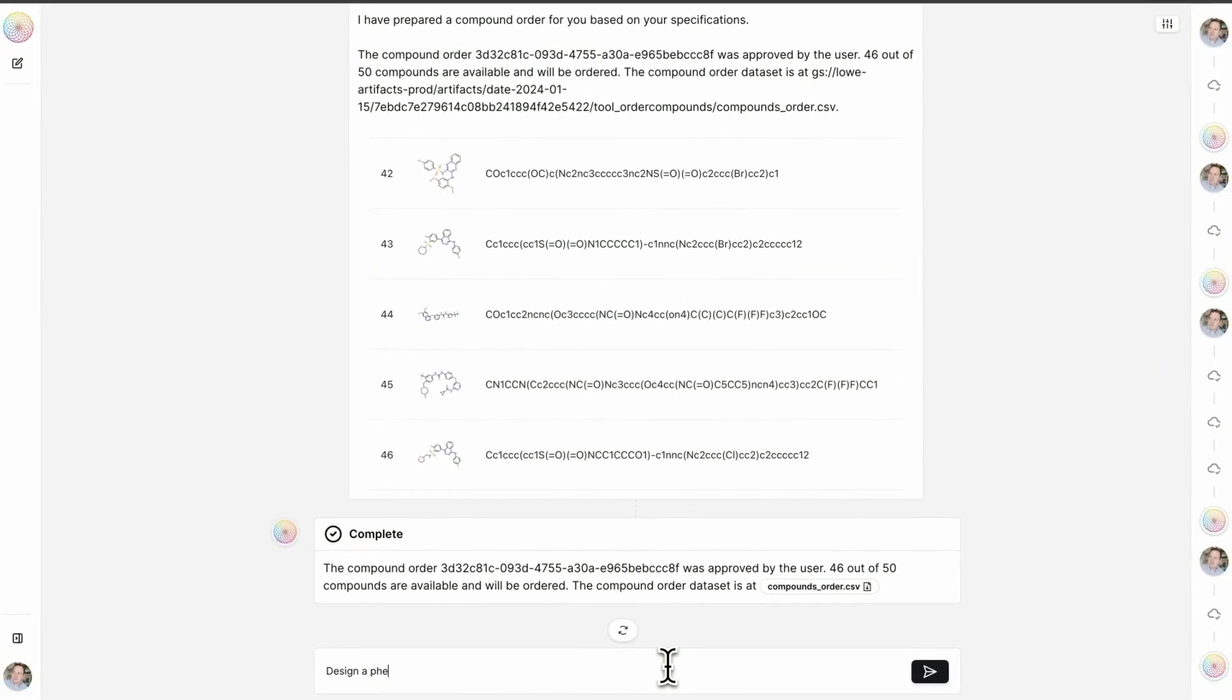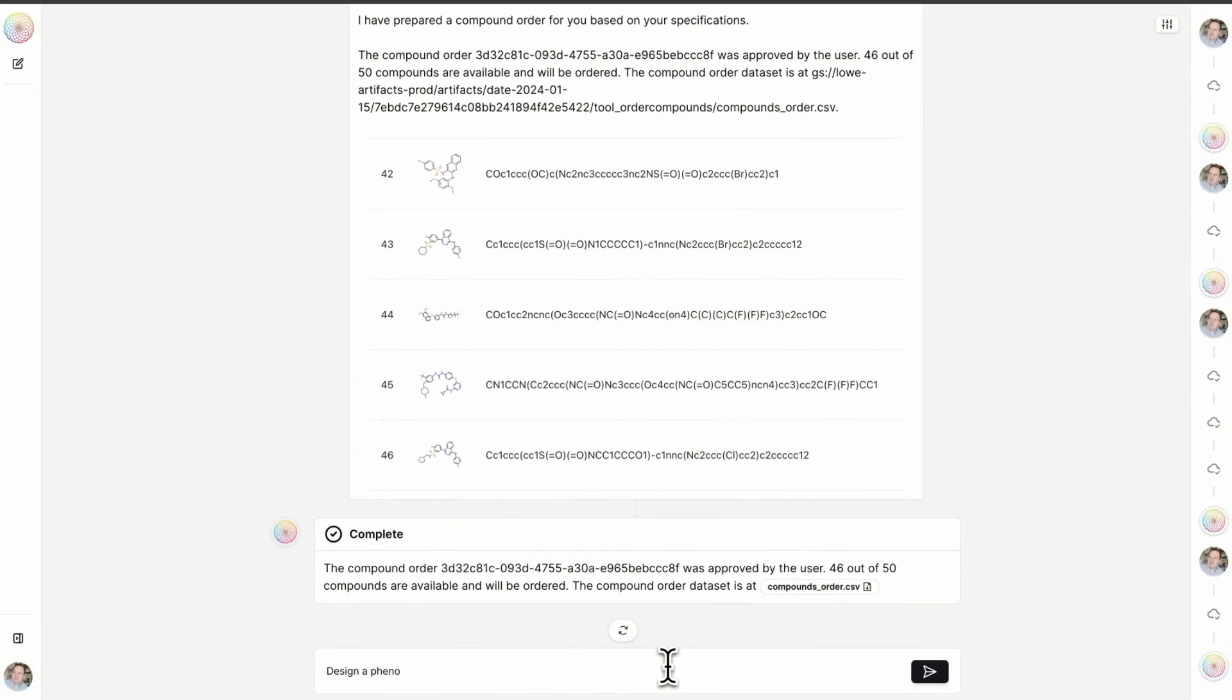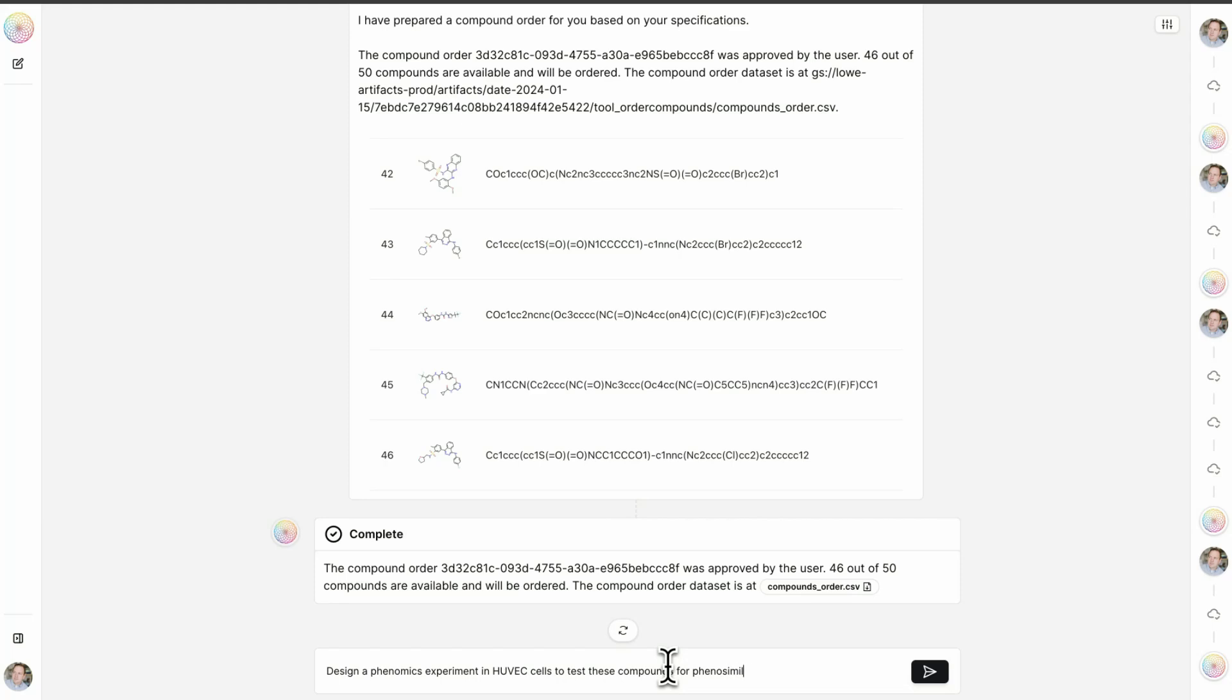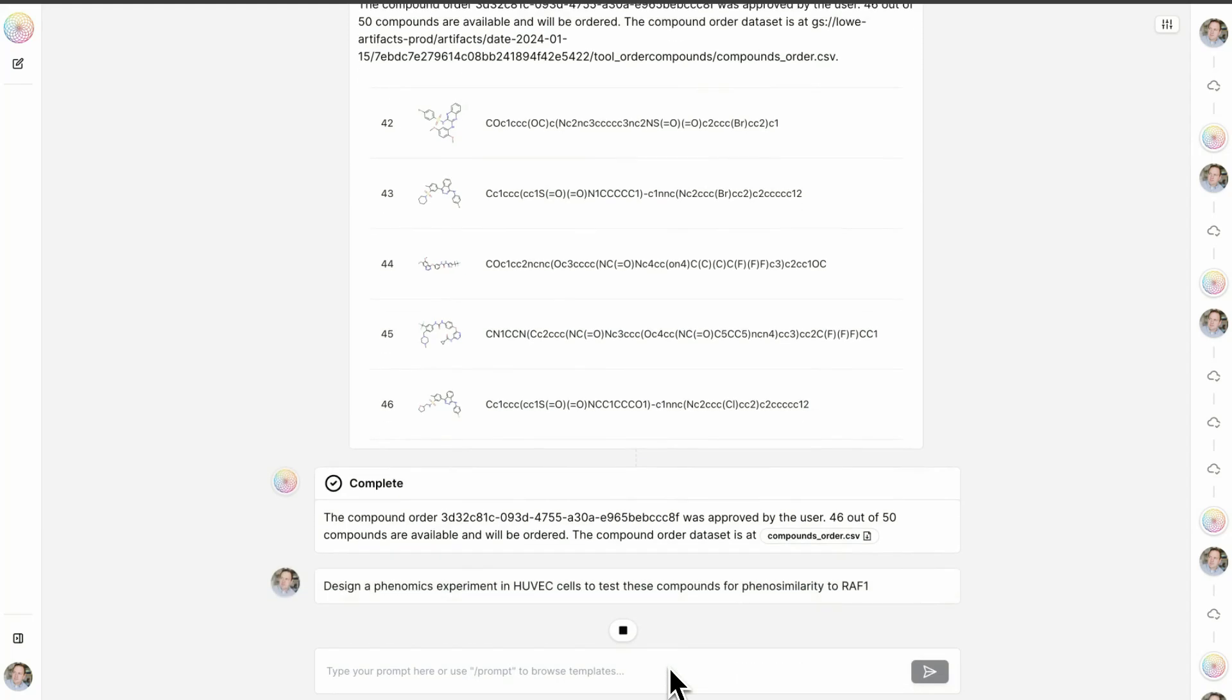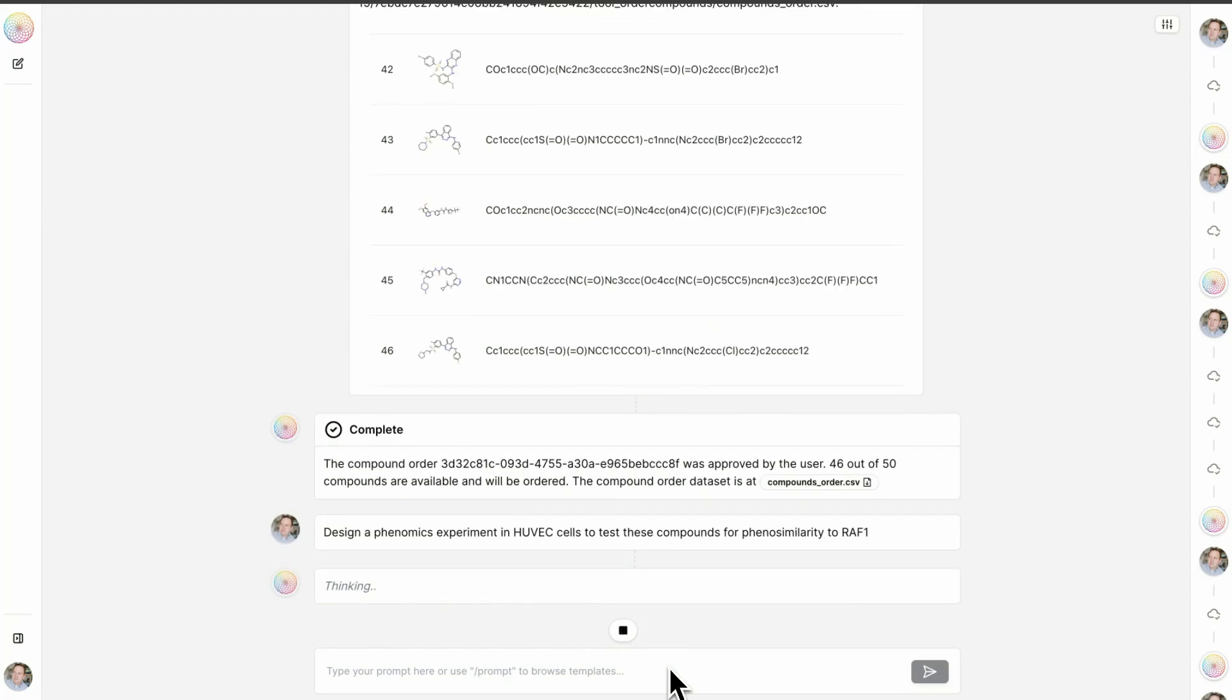Design a phenomics experiment in HUVEC cells to test these compounds for phenomic similarity. Perfect.